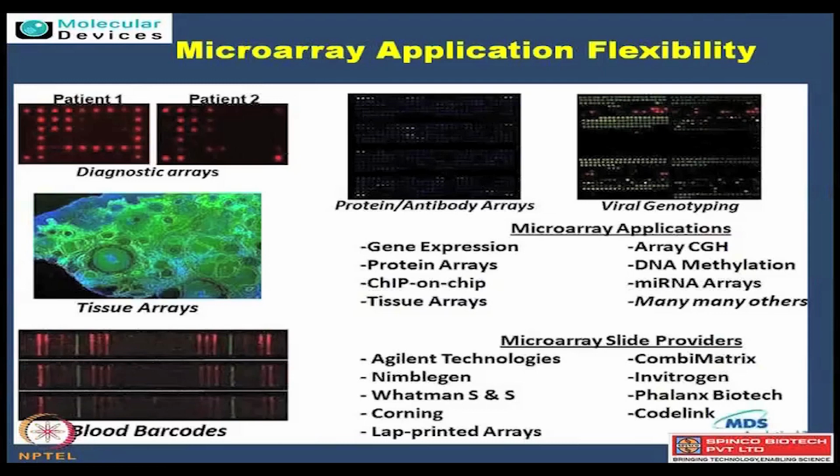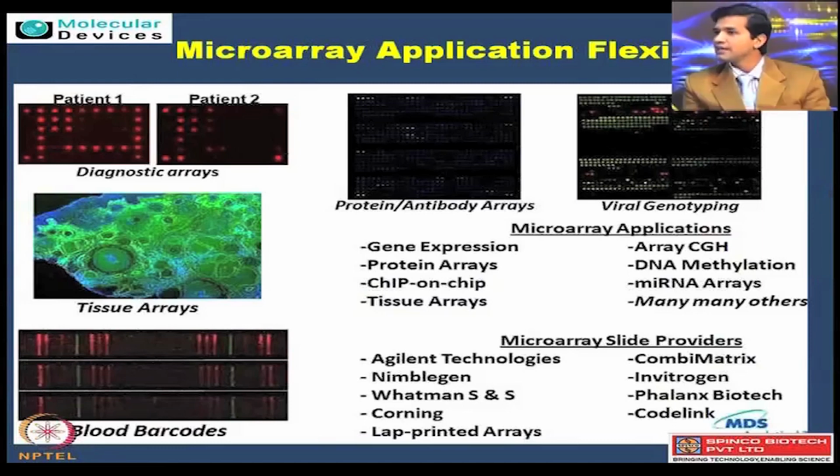And the protein arrays are now really catching up in many senses, because the protein is actually the biological function, what many scientists believe. Right. And I am also a strong believer. So now people are moving from the DNA to the real functional part, how they are directly affected. The major bottleneck was looking at the antigen antibody reactions. Like the proteins are all being seen, there is no general formula, but now the field is catching up. So even at the level of protein arrays, this is compatible. The incoming tissue array, which is really in infancy, is also now compatible with GenePix Pro.